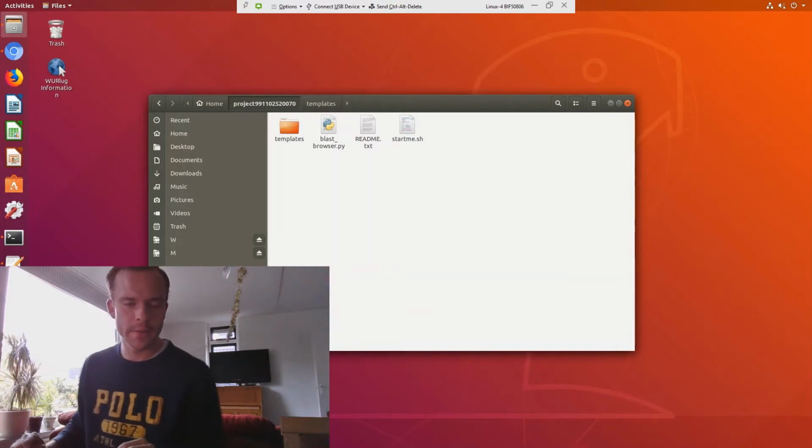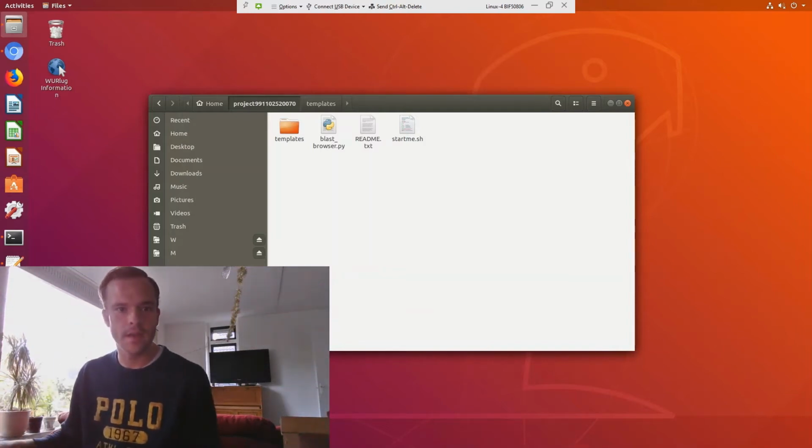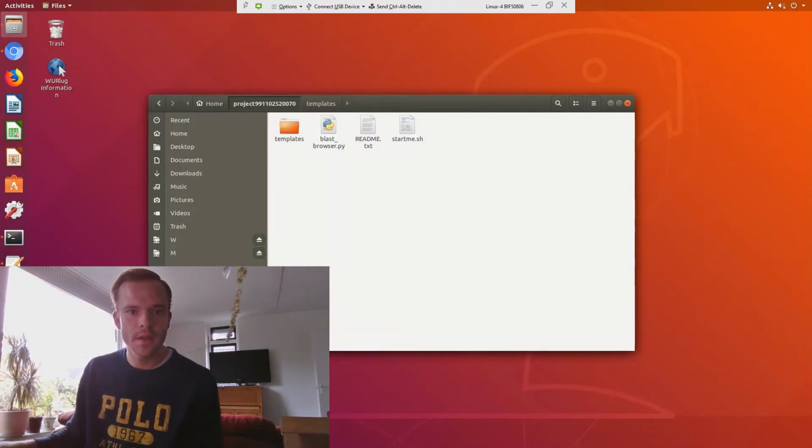Hello, my name is Pieter van Linde and I made the BLAST website, BLAST browser. The goal of my project was to build the BLAST browser.